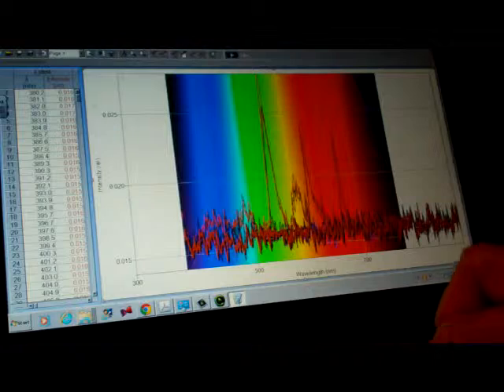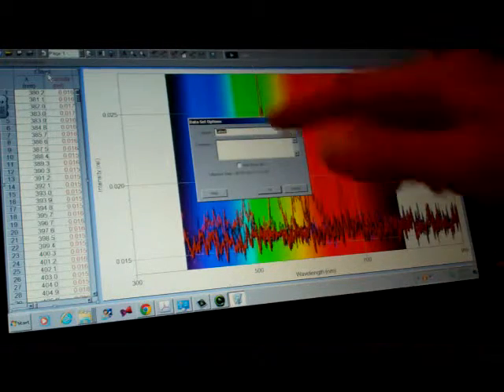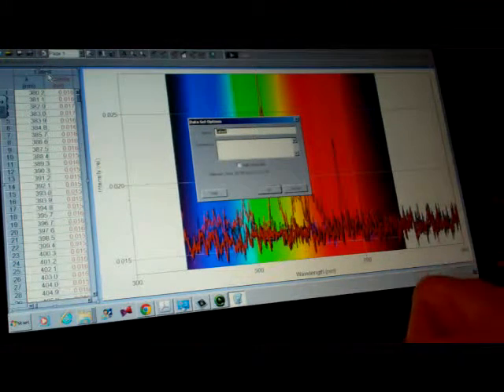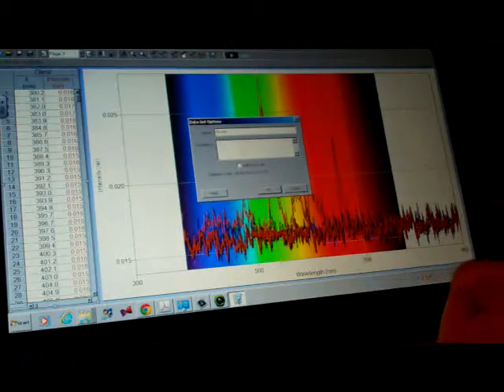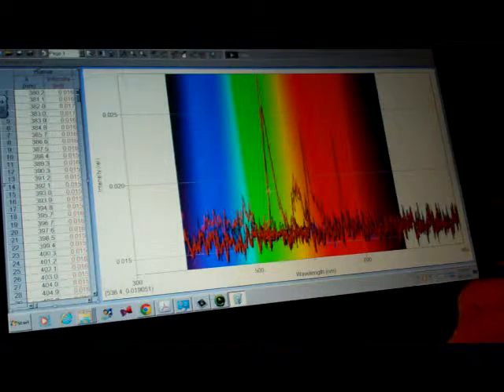Now, what did we do during the experiment? Well, what I'm doing is back over here in the data table under latest, I double clicked, and if you recall, that first part was just the Bunsen burner itself. So I'm renaming latest to be burner.